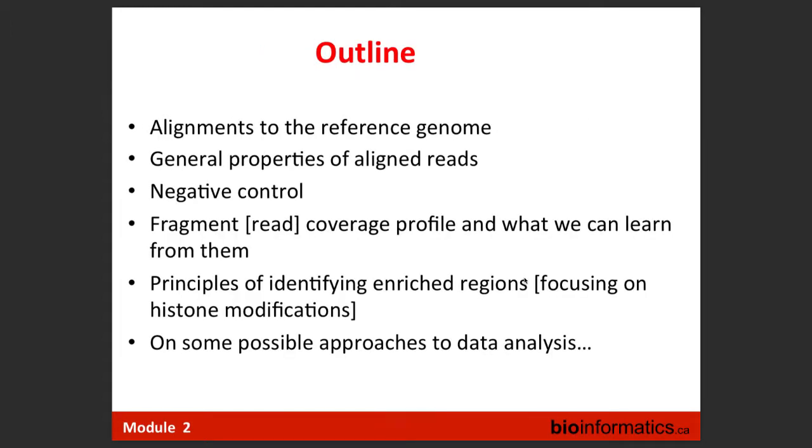So that's the outline. We'll talk about alignment, general properties of the reads, negative control, how we generate a coverage profile after we align reads, principles for identifying which regions are enriched, and the approaches to data analysis.